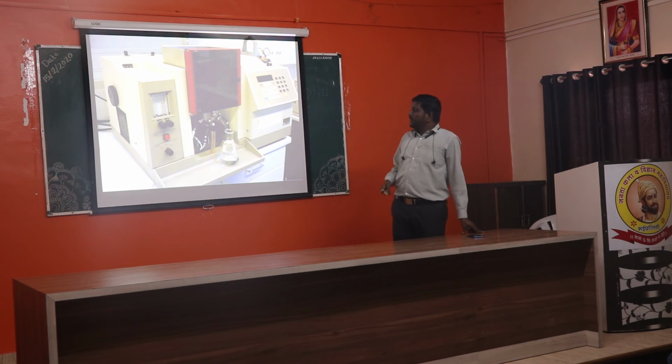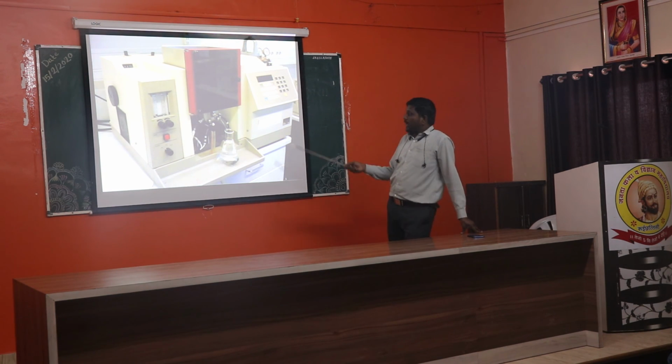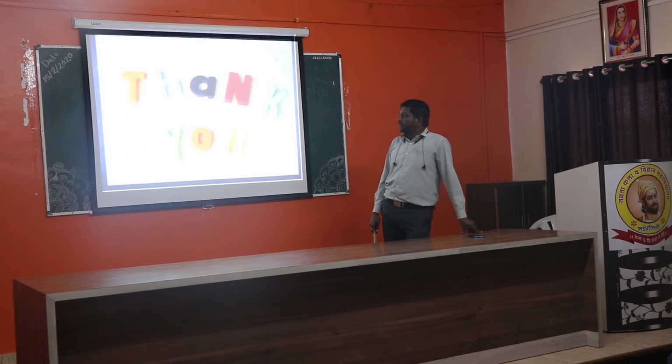Okay, this is the instrument of AAS. It looks like this, and on this you have to perform any practical or any work related to AAS. Next, thank you.